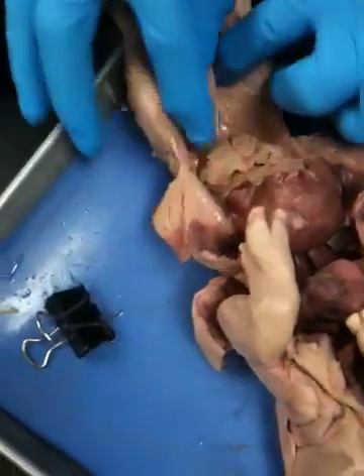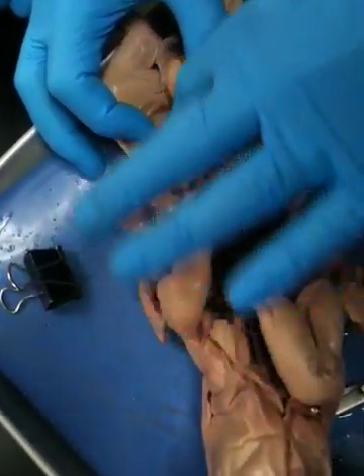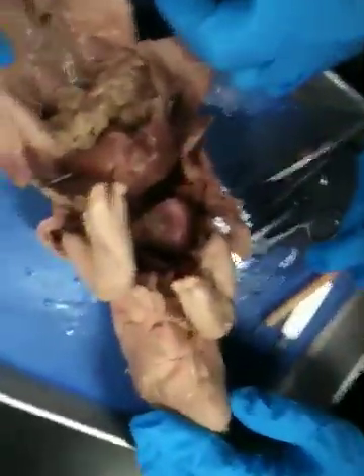So is that the hepatic vein? No, it's not. Umbilical vein? Thank you. Why is it a vein? Because it's taking blood back towards the heart.